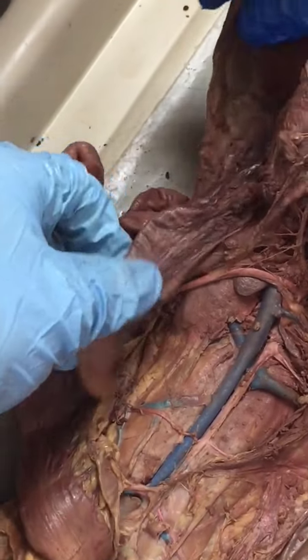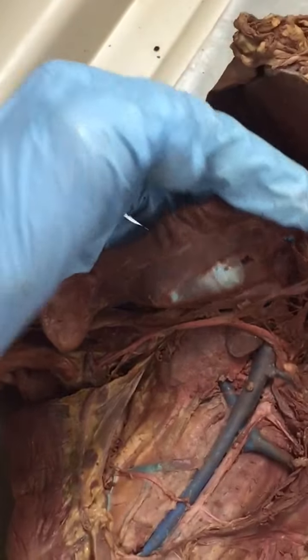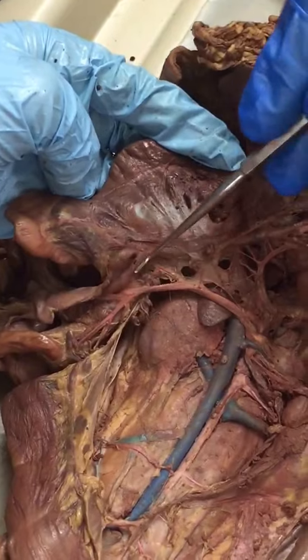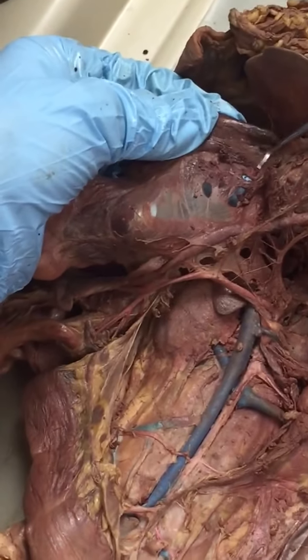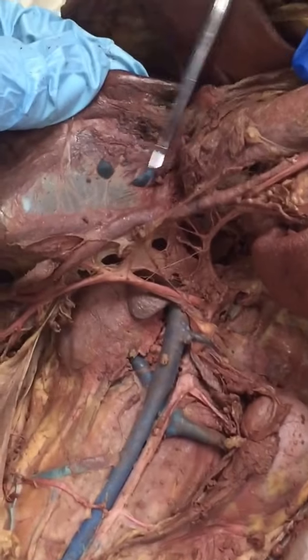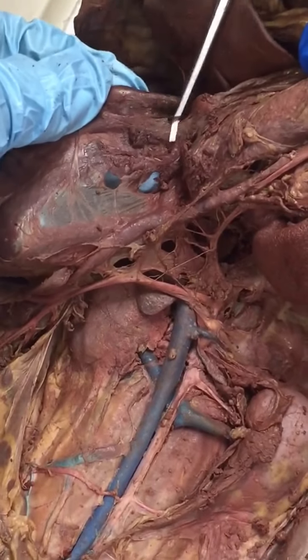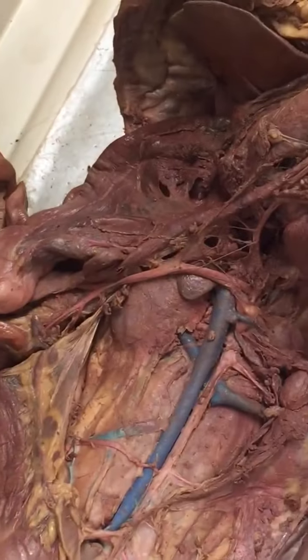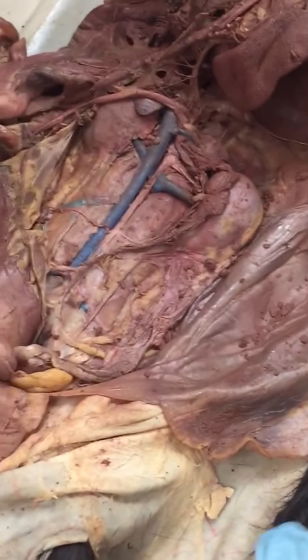Okay, remember that anterior pancreaticoduodenal artery I was talking to you guys about before? It was a branch of the gastroduodenal from the other side. So that is up here. So remember, this is posterior pancreaticoduodenal artery here, and the anterior pancreaticoduodenal. You have to scrape away the pancreatic tissue up here at the very beginning of the duodenum, but that there is the anterior pancreaticoduodenal artery, and it connects over to the gastroduodenal, but I'm not going to make you find that connection. This is kind of challenging. All right, that's all. Any questions?